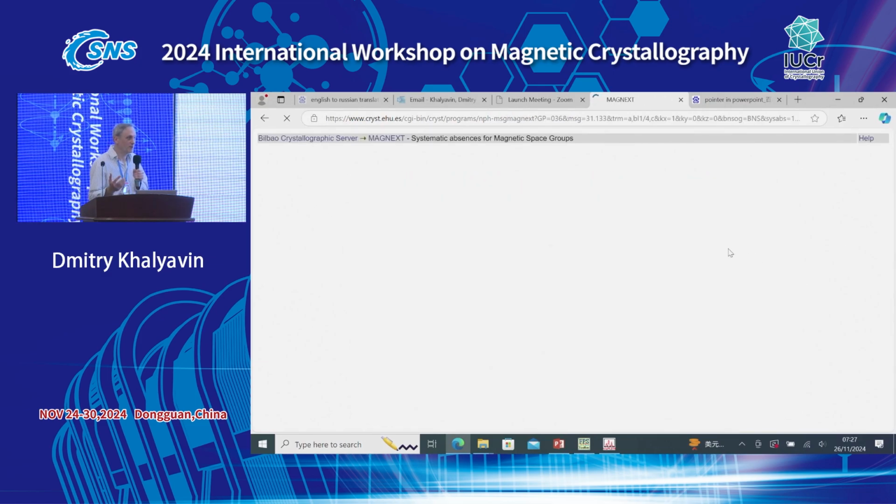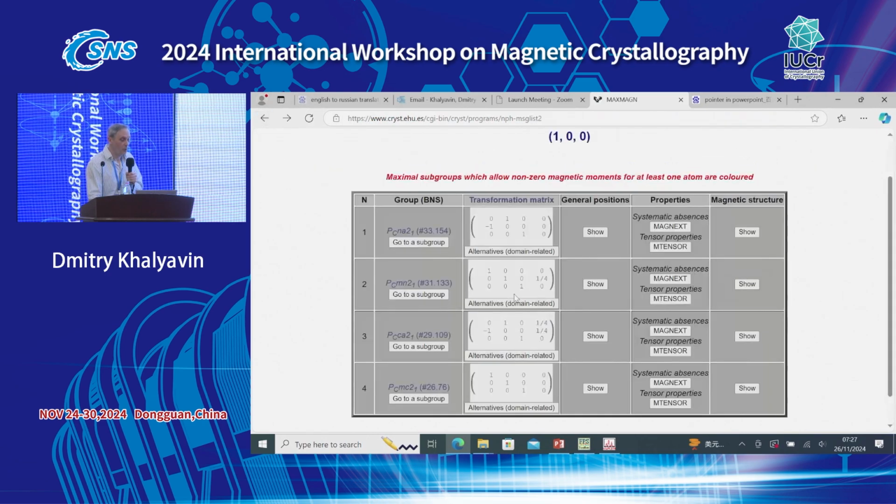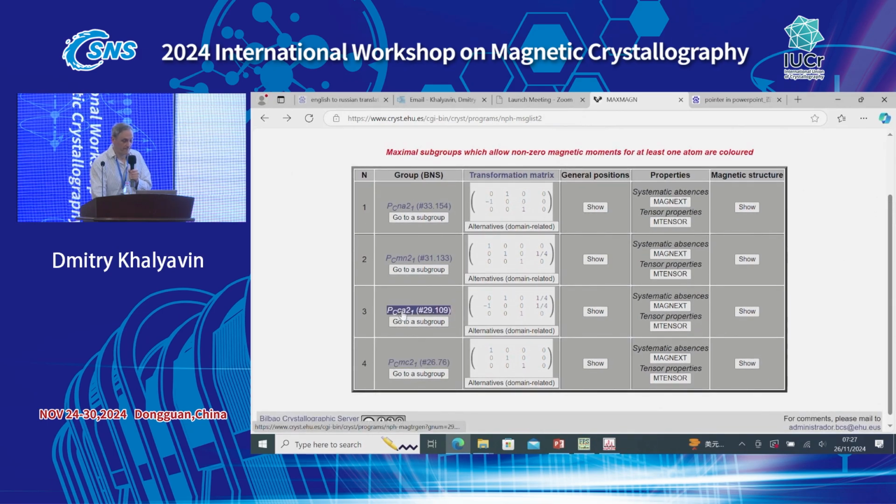Okay, but it's still only 4 choices. It's not such a big number, and we can check all of them one by one. But I won't waste time checking all of them. I just tell you that as far as I remember, and not 100%, but I think it's this one, number 3. So this space group, I hope will do the job.